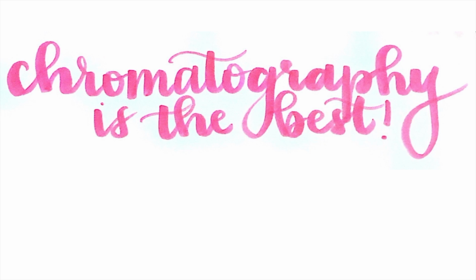Now we know that chromatography is a separational technique where individual components of a solution or mixture pass through a medium and travel at different rates because of their intermolecular forces.